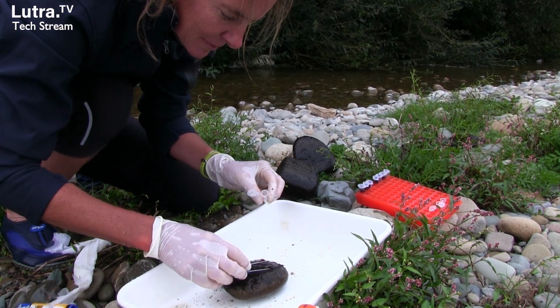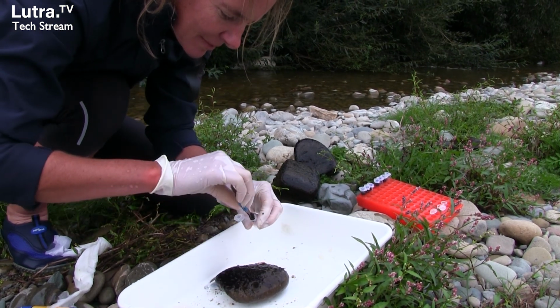But it is really hard when you're just starting out on your cyanobacteria monitoring journey to go down, look at a rock, and say, oh yeah, that's Microcoleus, that's cyanobacteria, there's some green algae, here's some diatoms, particularly the diatoms in the cyanobacteria. So when you're in that situation, what you want to be doing is to collect that rock, pick it up, and then scrape it off into a tube.